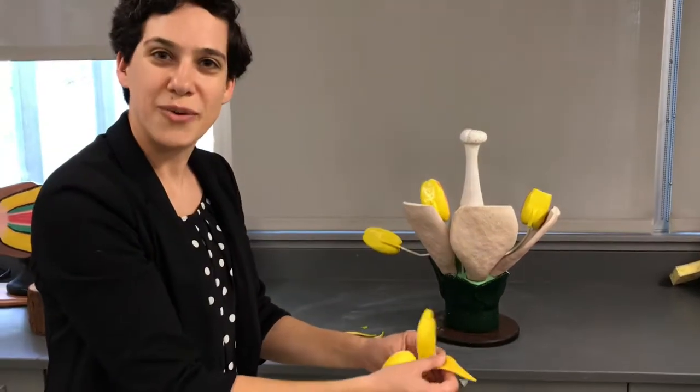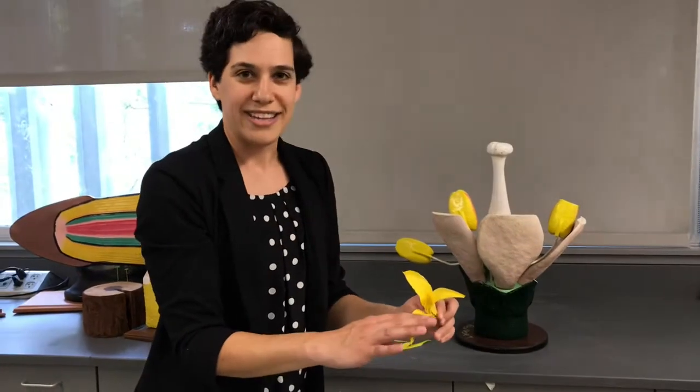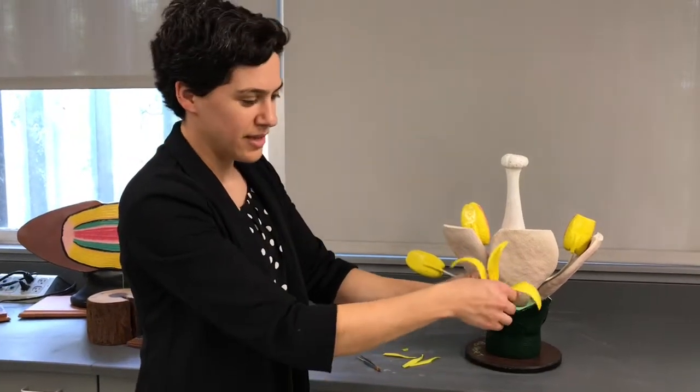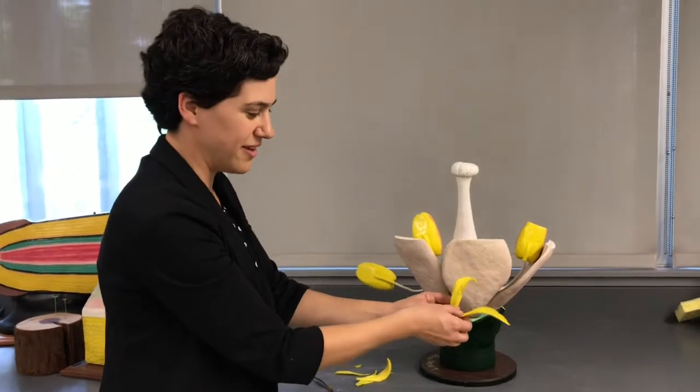Petals are often showy and colorful, and sometimes they can even provide landing platforms for pollinators, like insects, birds, or bats. So I'm going to peel off the petals now so we can see what's inside our flower.